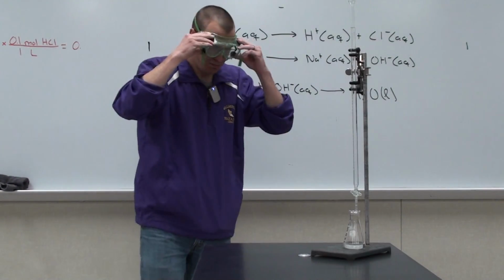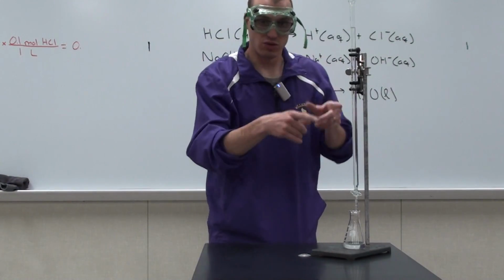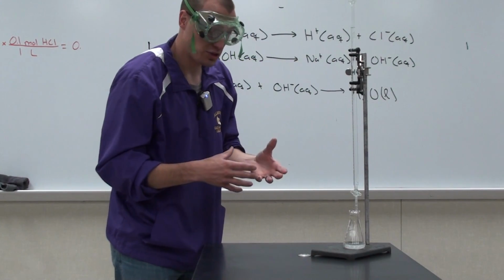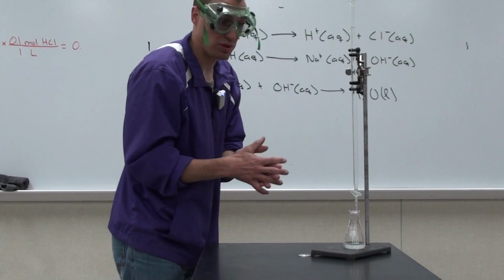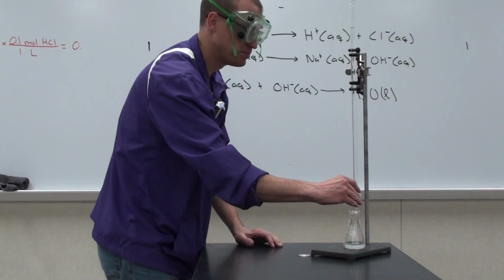Safety goggles back on, and I'm going to add again 23 milliliters of NaOH, and we're going to look at the board and see what happens to our pH after all this process goes on.